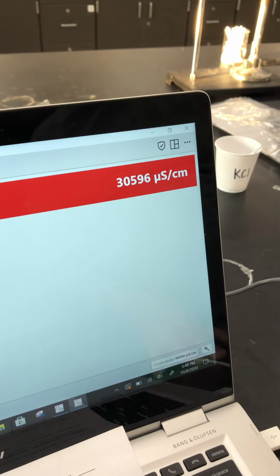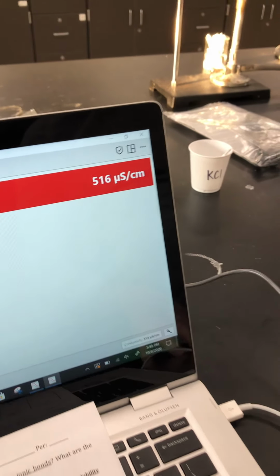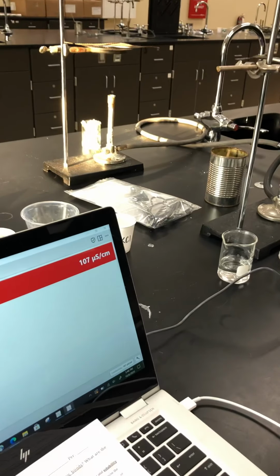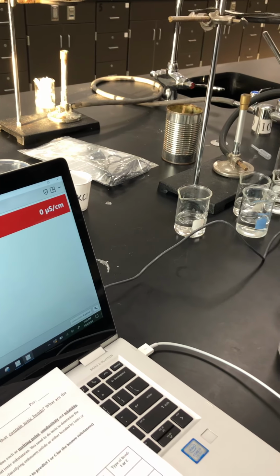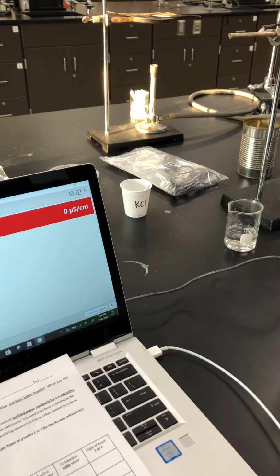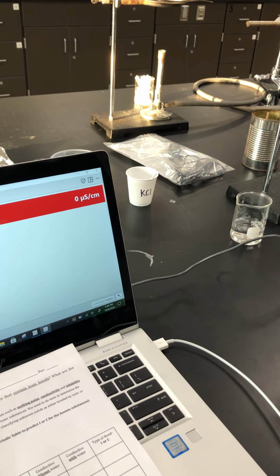As you can see, the value went above 30,000. This one is very conductive. So I'm rinsing off the probe with distilled water to try to get my conductivity probe to read back to 0. So I'm going to continue rinsing until it reads 0. Good.